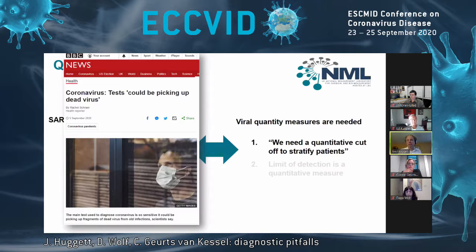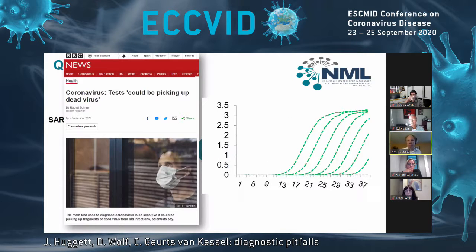There's a problem, though, and that's the discussion around the qPCR. This is the method that appears to be discussed on how you might do those cutoffs, and particularly the cycle threshold or the quantification cycle, and whether we can have a particular quantification cycle of, say, 30. And if you look at the plot there, 30 would be on the right-hand side down here. And so what they're saying is that perhaps anything later than 30 should be considered as a negative.